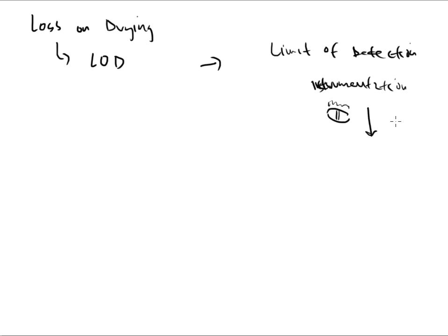If you're in a laboratory, typically you are doing the same types of tests all the time, and if you come into a lab and the LOD is a drying method, there's probably very few times that they will use LOD for the limit of detection test. If so, they will probably say limit of detection. They are not going to use that abbreviation and confuse you every day, all day, because they haven't really discussed what LOD means in a lab. So LOD, loss on drying, and that's what we're doing today in the lab.